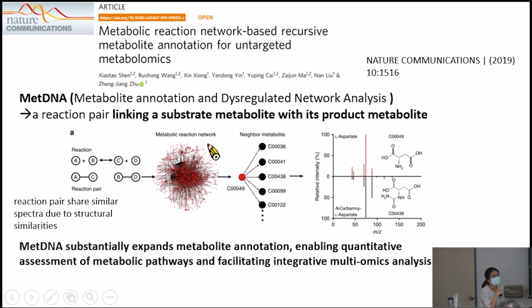This probably also gives different charge states, even though the mass is still the same, but the charge is different. So are you saying we need to add one sample using different charges to isolate? Automatically it will have one positive charge, two positive charges, so there will be two peaks. Okay. So, metabolite: what's the definition?